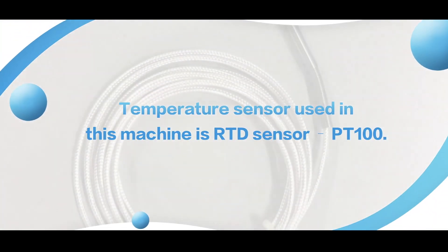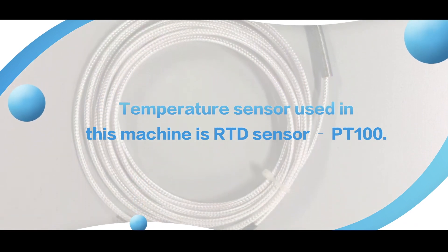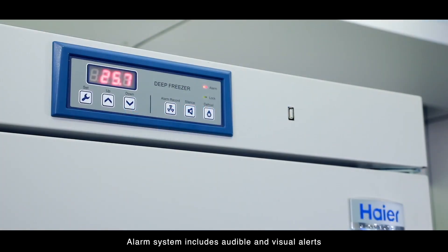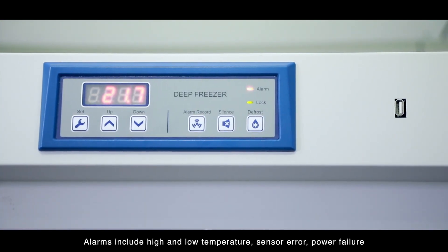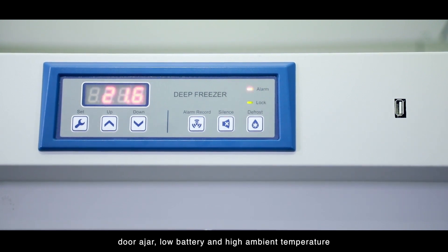The temperature sensor used in this machine is RTD sensor PT100. The alarm system includes audible and visual alerts. Alarms include high and low temperature, sensor error, power failure, door ajar, low battery and high ambient temperature.